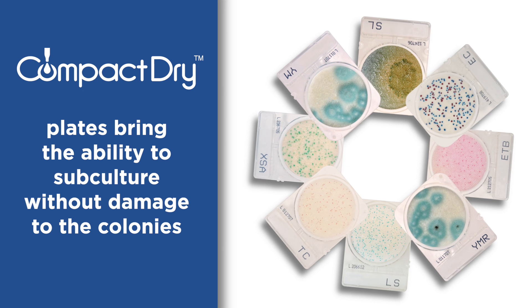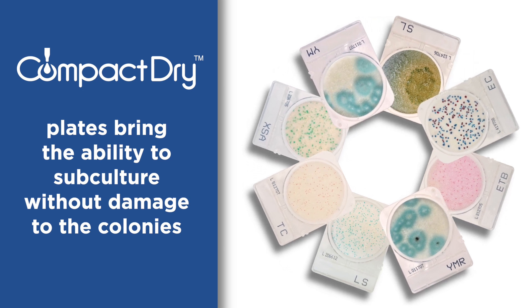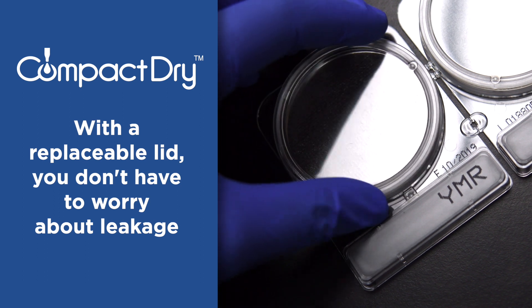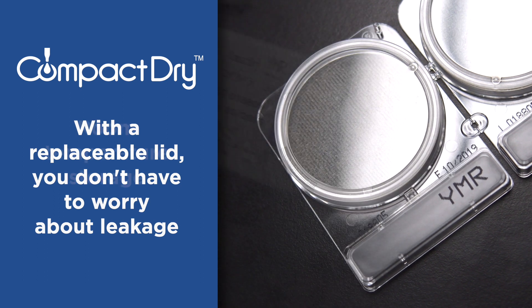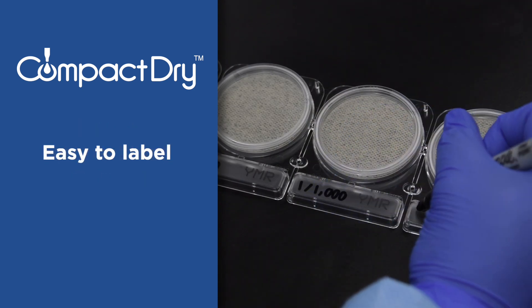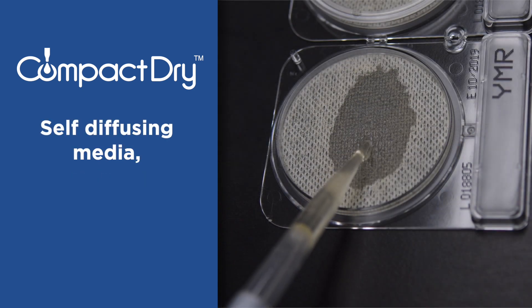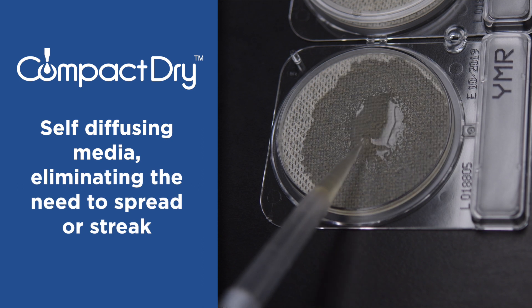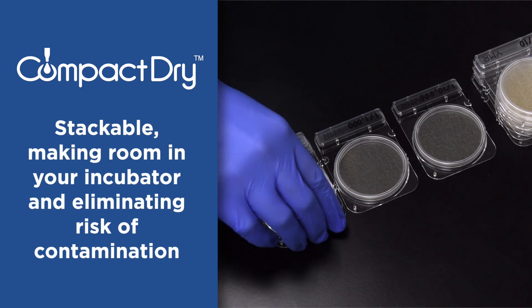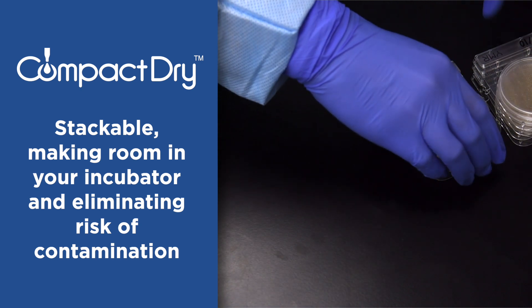CompactDry plates bring the ability to subculture without damage to the colonies. With a replaceable lid, you don't have to worry about leakage. Room temperature storage. Easy to label. Self-diffusing media eliminates the need to spread or streak. Stackable, making room in your incubator and eliminating risk of contamination.